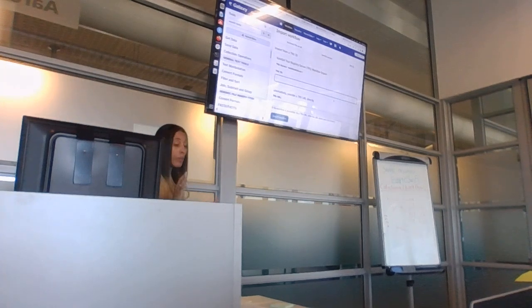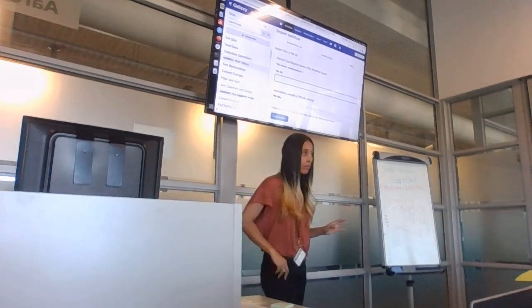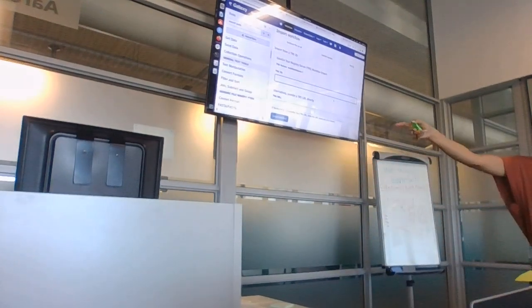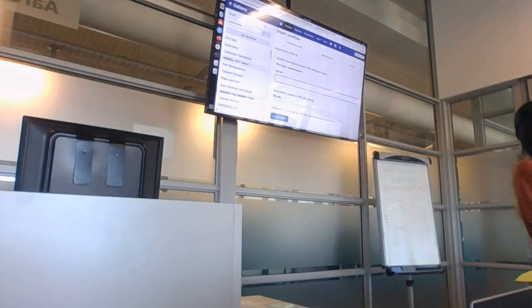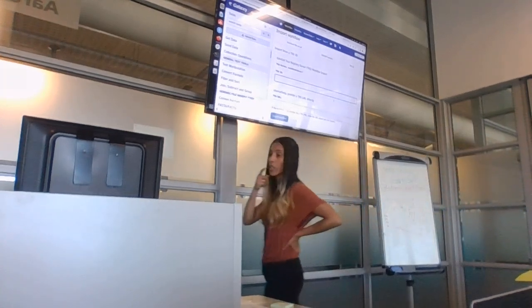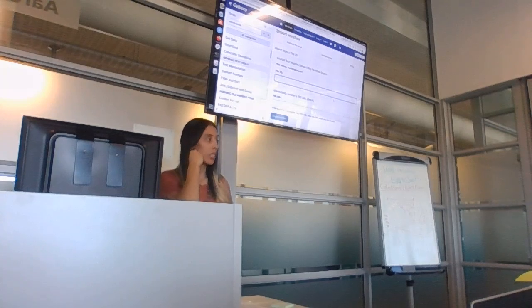I'm hoping one of you will be able to create one for cholera, and then upload it to a public repository so that we can download it. Peter and them are working on the issue that Ndafa and Tuli had with the midnight primers for SARS-CoV-2. They are working on one to put into Galaxy, but it doesn't exist.